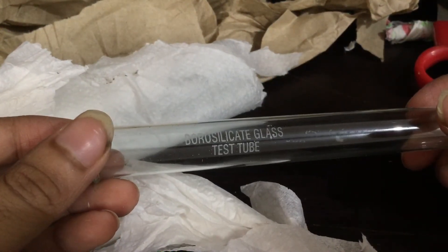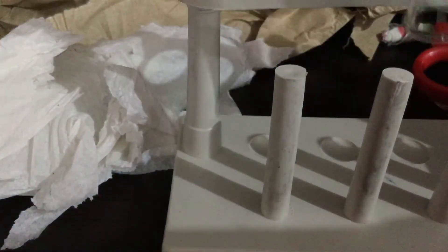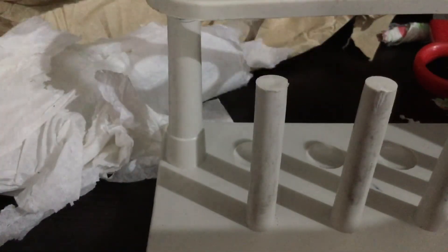I guess these are test tubes — yes, five test tubes! Let me show you one. It is borosilicate glass test tubes. I can keep them in the test tube holder. I've kept one in — it's pretty good. I think I can remove all the test tubes from packaging and keep them in the rack.